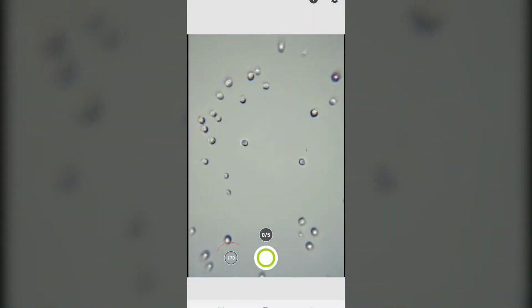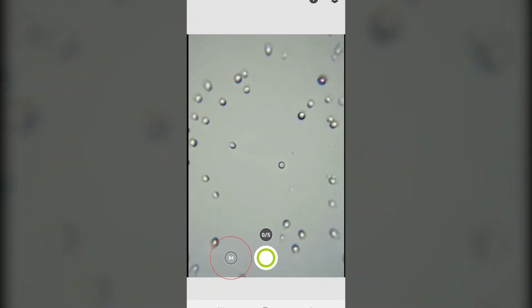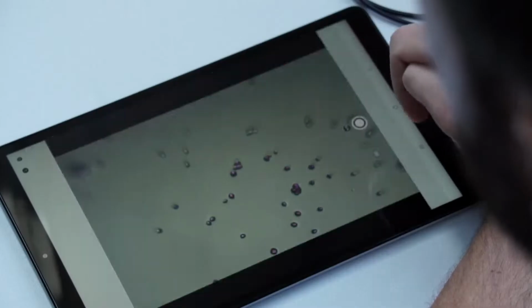Step 5. Take the image. The sharpness indicator on the bottom left helps you to take optimally focused images. Aim for the highest number possible. This number will differ from image to image. Focused images should look like this. Click Keep if you are happy with the image.